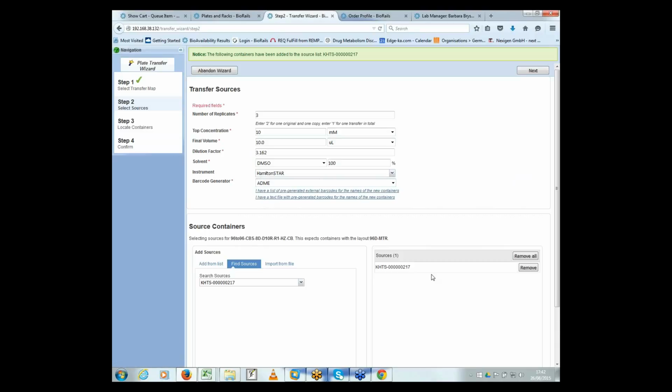this will record the transfer operation, and then you can actually use the automation software with the Hamilton Star robot to process the final order to actually generate the physical plate. So we'll do that, and that's going to stamp out that plate operation to create the virtual plate before I go ahead and create the real one using the robotics equipment.